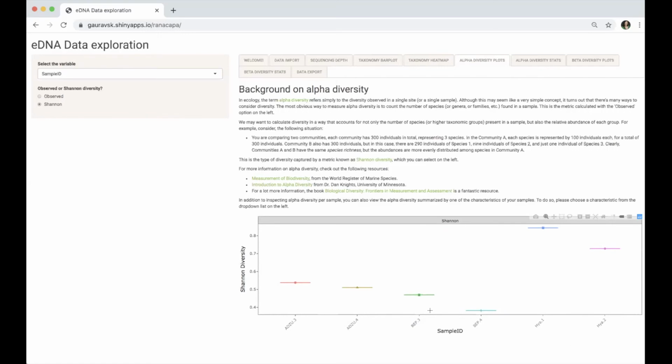Okay, so what does this mean? Well, if we think back to our forest example, basically what this is indicating is that the black-eyed pea samples, although they might have a lot of different kinds of bacteria, are probably highly dominated by just one type of bacteria. And probably hyacinth, even though they may have fewer total unique types of bacteria, maybe their numbers are a little bit more evenly distributed as compared to the black-eyed pea.